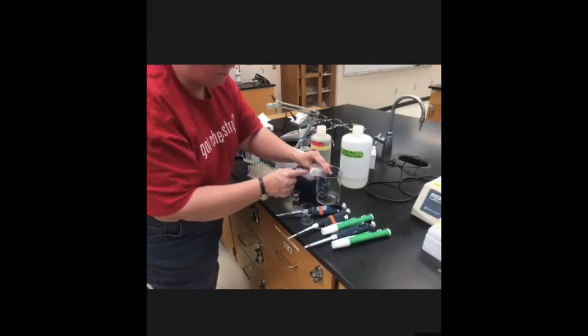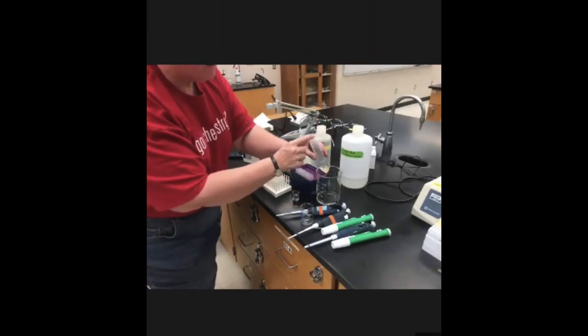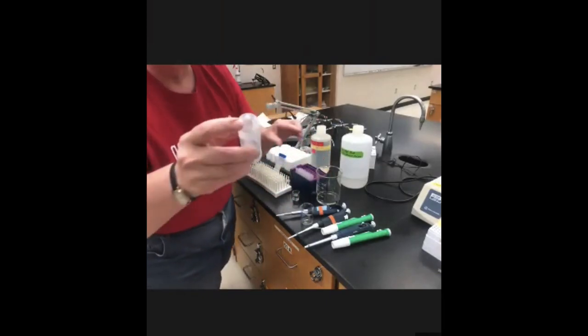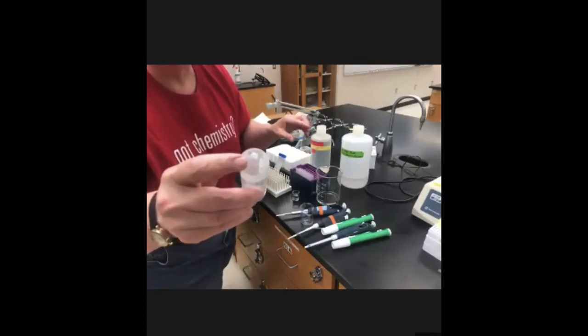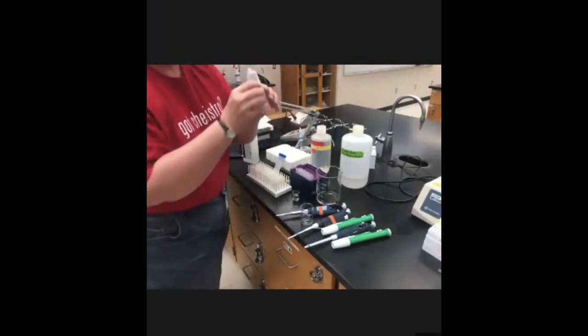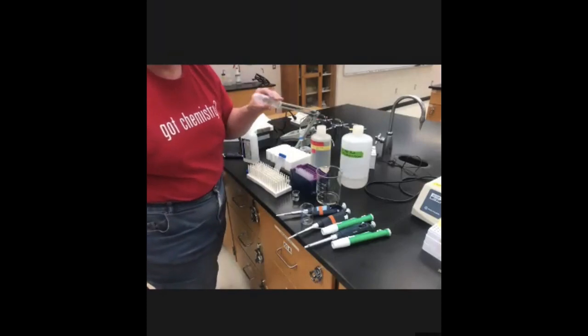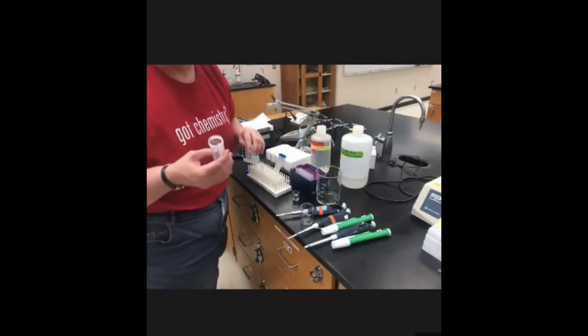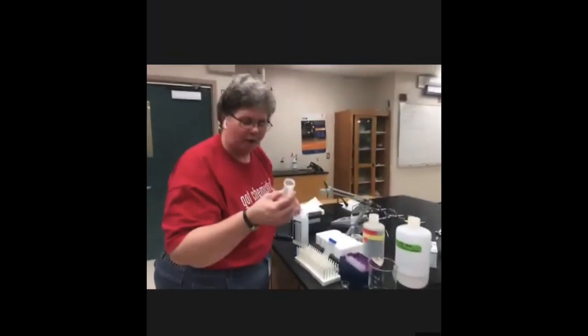Keeping an eye on the pellet. And we have a very, very tiny, very difficult to see pellet right here. It's very, very small, very hard to see. It's just a small white speck, basically. But actually, that's probably at least a half milligram of DNA. So a little goes a long way with DNA.